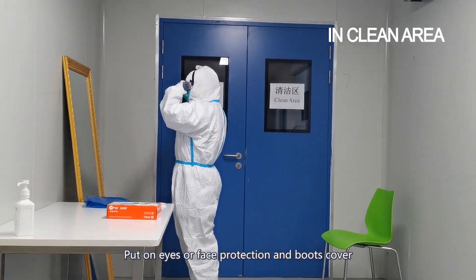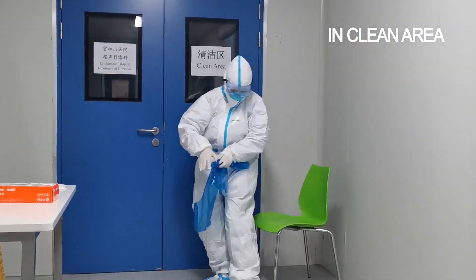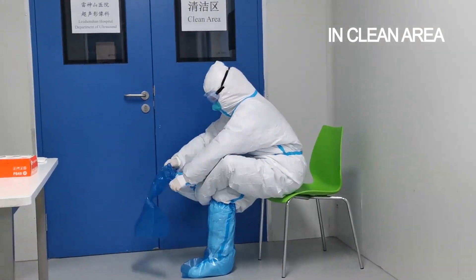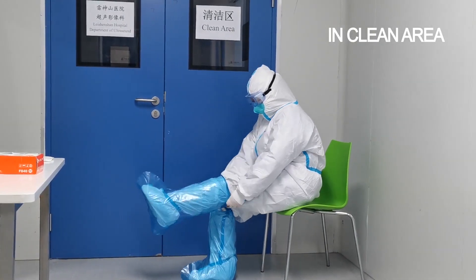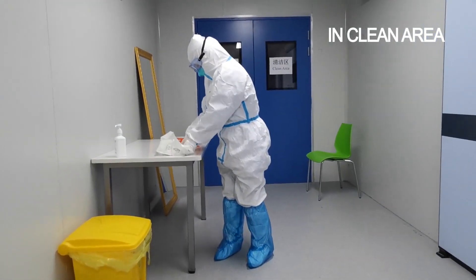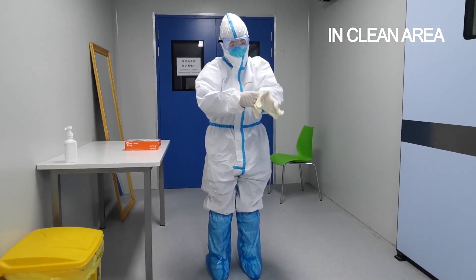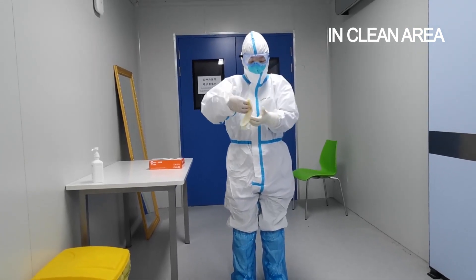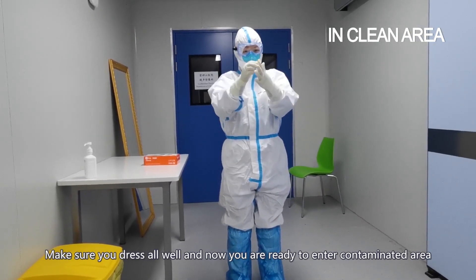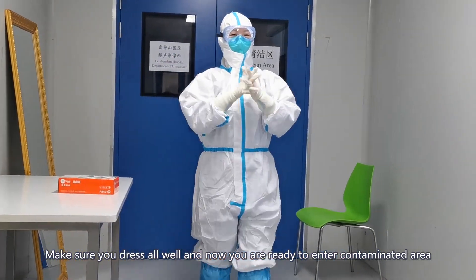Put on eyes or face protection and a boots cover. Put on the second pair of gloves. Make sure you are dressed well and now you are ready to enter the contaminated area.